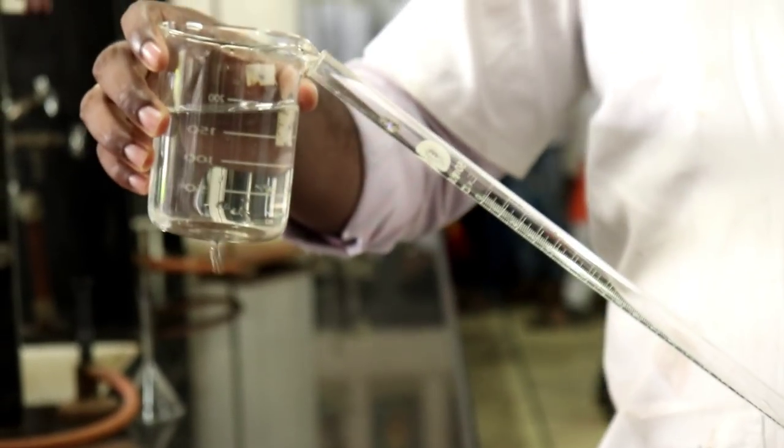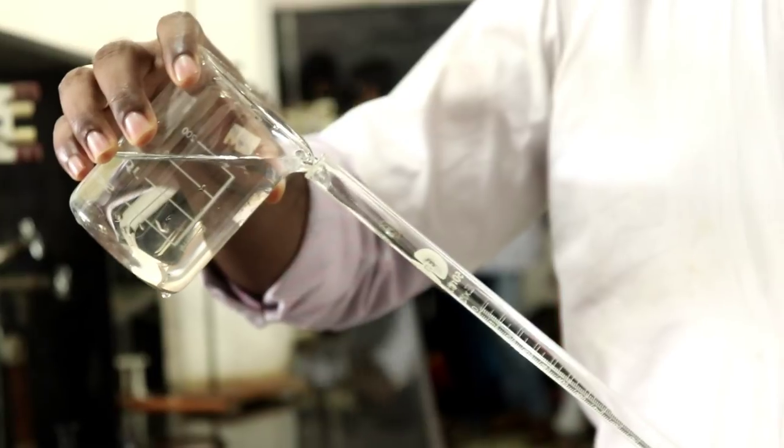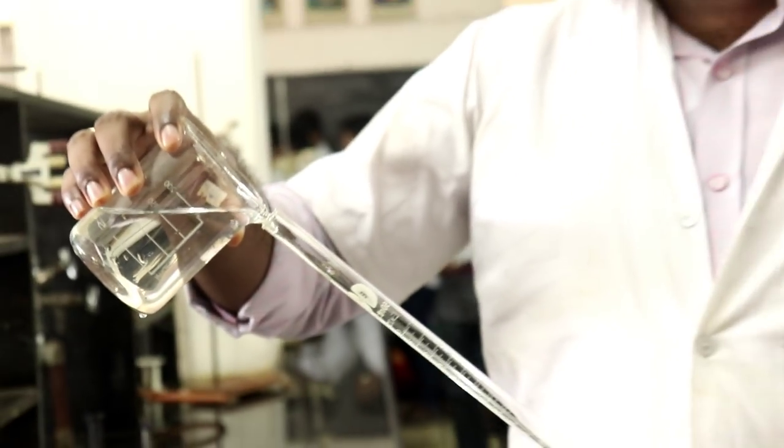The next step is to put some amount of the titrant into the burette and repeat the same steps.